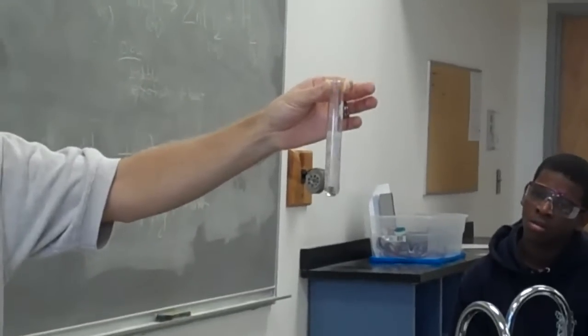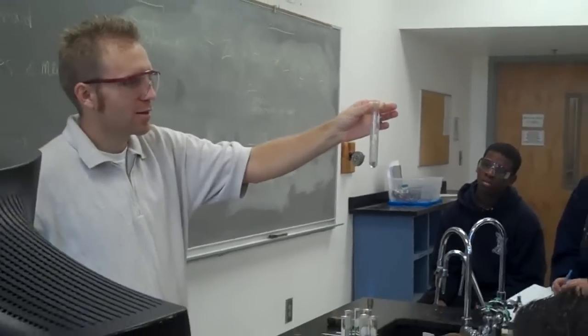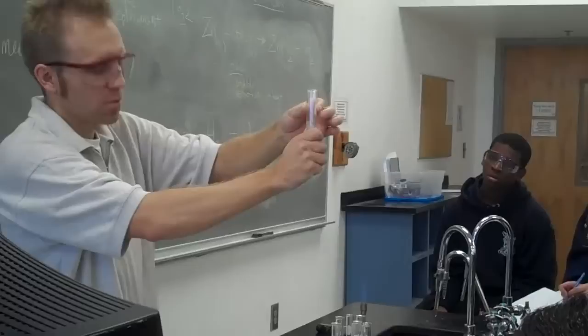You've got a metal reacting with a liquid. Is it dissolving? You can see the vapor. Is it? That's the steam, like the heat. And it might be some acid vapors too.